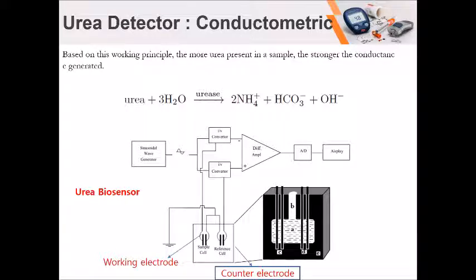So when the solution or sample comes in contact with the working electrode, an electrochemical reaction takes place, and transfer of electrons occurs, and the pH of that solution is also changed, and resistance between both electrodes is changed. It means the conductance is also changed, since conductance and resistance are reciprocal to each other. So here, by using the monitor, that change can be measured.